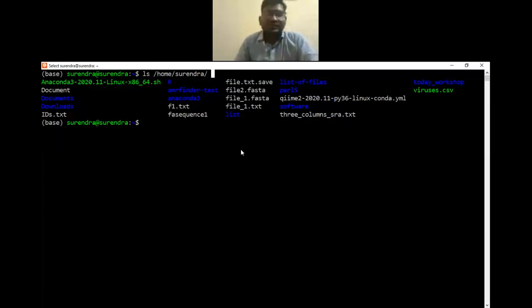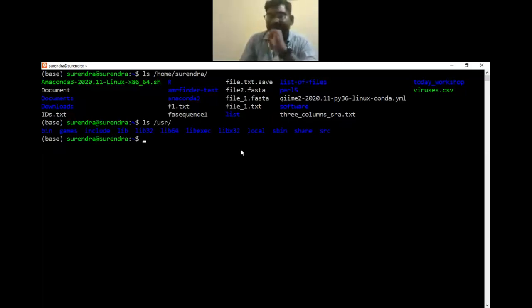Sir, you can go to any location, like ls /usr, which is inside the root directory. Sir, where do we have to install Anaconda 3, in the root directory or in the user directory? Inside the user. Okay.